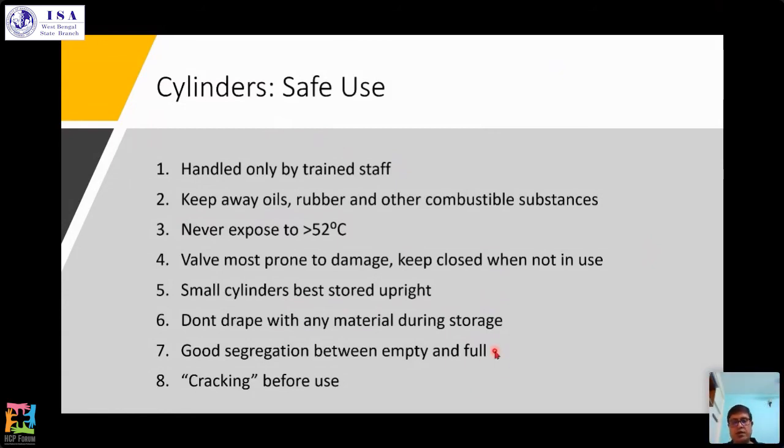Good segregation between empty and full. You do not want to be caught empty-handed when you want a full cylinder. And cracking before use. Cracking is a favorite of many examiners.